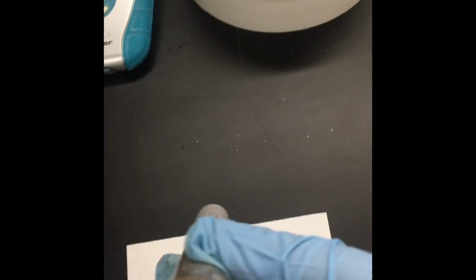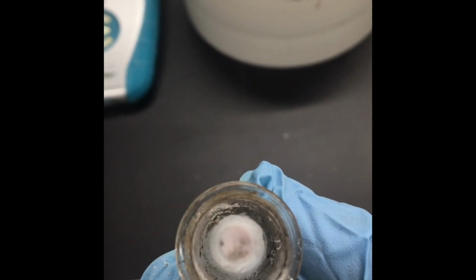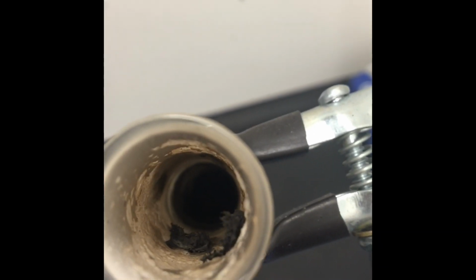And no sign of the gummy bear. The color means nothing, although maybe you can see what color was the gummy bear that I used yesterday. It's a red one. I wonder if the one that we have here, I'm gonna go back and see, well, yeah, we can't see anything yet. But maybe what we will see is that the color of green remains.